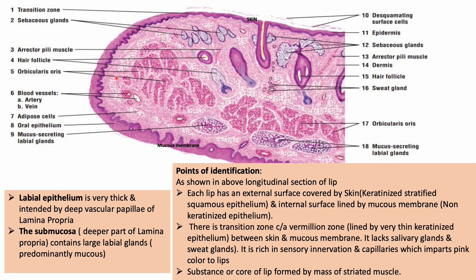Then the transition zone begins. There is a gradual transition from the epidermis and dermis of the skin. As we reach the labial epithelium, the epithelium becomes very thin and is indented by the vascular papillae of the lamina propria. Deep to it, in the submucosa, we have large mucus-secreting labial glands.